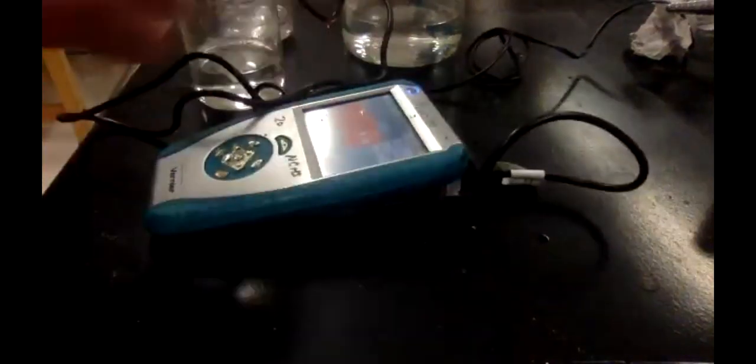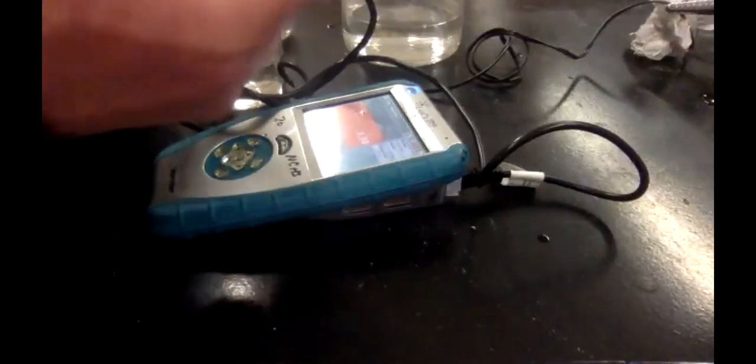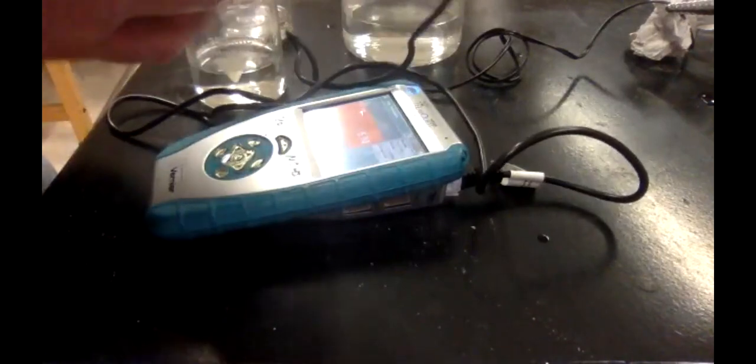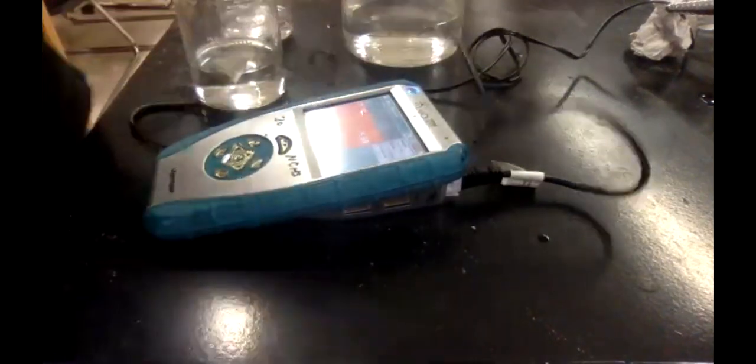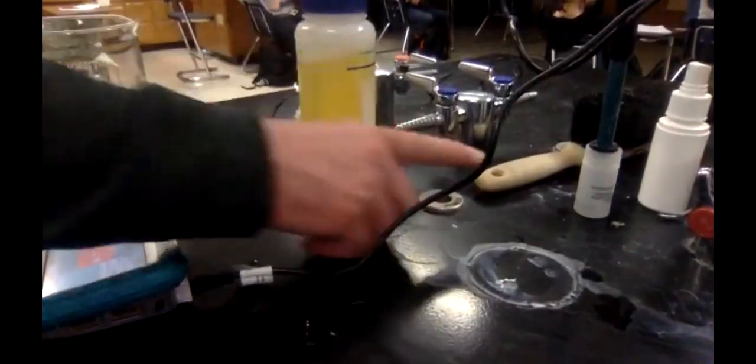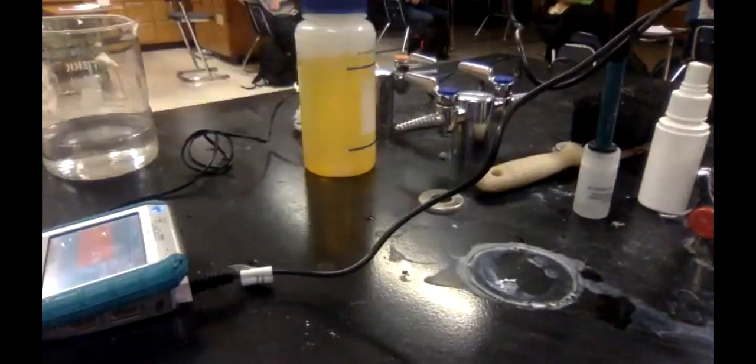So that's it. Basically, you turn these on. Now, keep in mind, they have to be stored in this. So you need to make sure that you put that back on and you tighten this up. When you tighten this up, it creates a seal around that. But it's not a perfect seal. So when you're all done with it, because we're using these next week as well, make sure that you loop the cord around the sink in some way that makes it so it does not fall over, like so. Can you see it? Make sense?